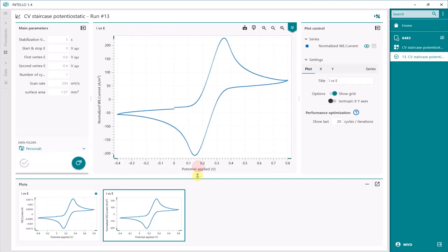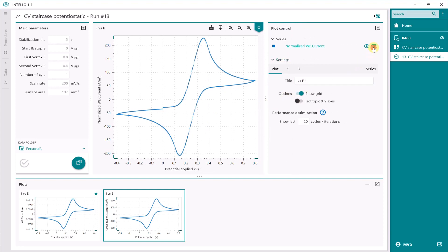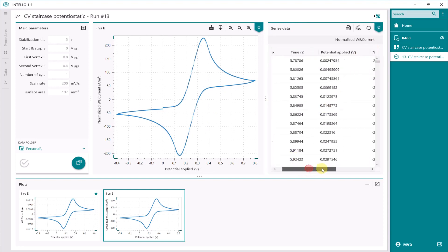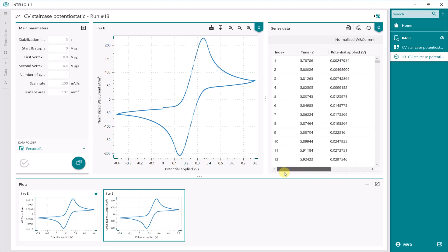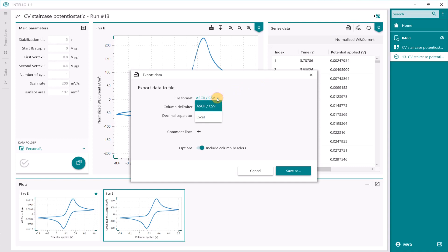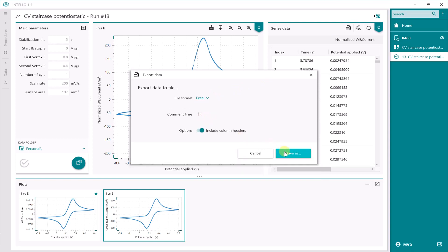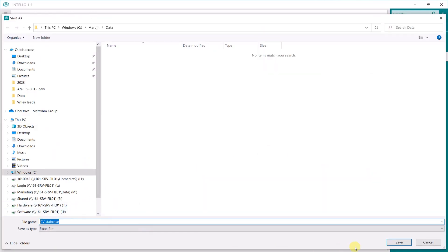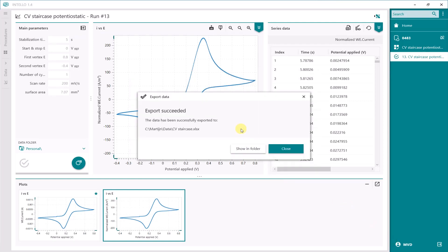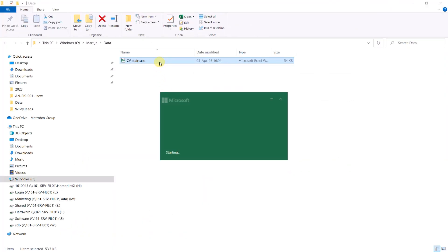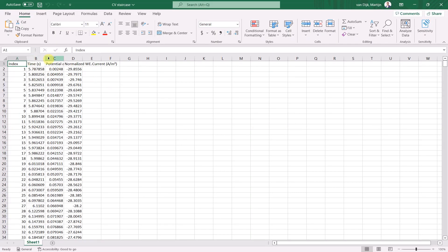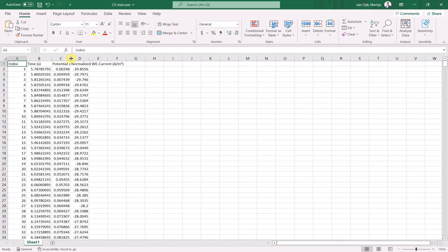If you open the plot, you can export these values. Go to the export file, or the data file, where you have the current density. This you can export to an Excel sheet, for example. Save as CVStaircase and show in the folder. In the folder you will see the raw data files appearing with the header.